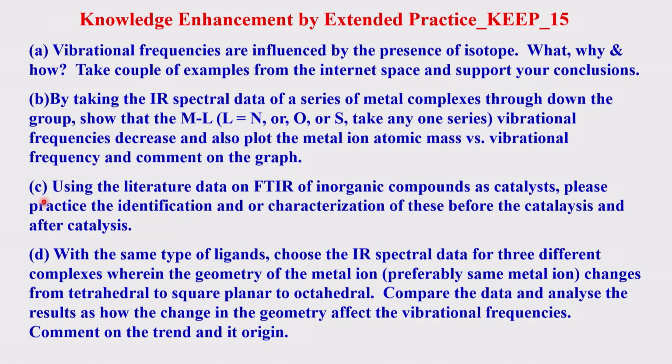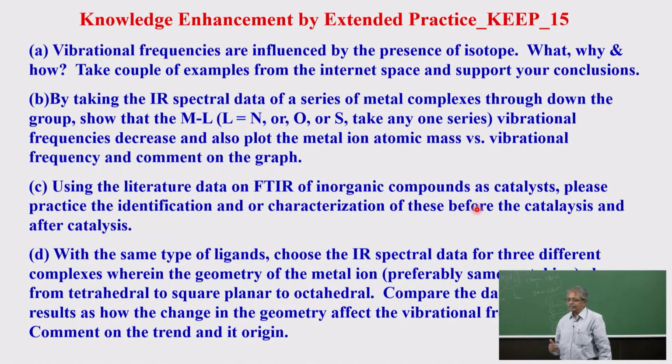I also urge you to use the literature data on FTIR of inorganic compounds as catalysts. Please practice the identification and characterization of these before and after the catalysis. They say that the catalyst is intact based on the FTIR. How is it intact? Please address that by looking at a few examples.